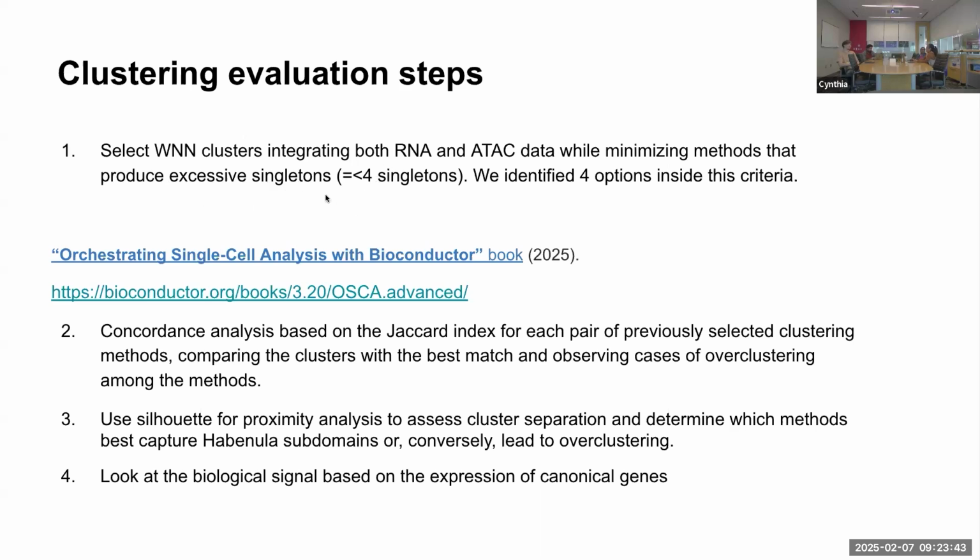So we are trying to reduce, and we find that we can reduce this to have only 4 singletons. So it was only from the 48 outputs that we have. Indeed, there were several options, but we reduced it to 4 because it was a more suitable number of parameters that we can configure to get this clustering.